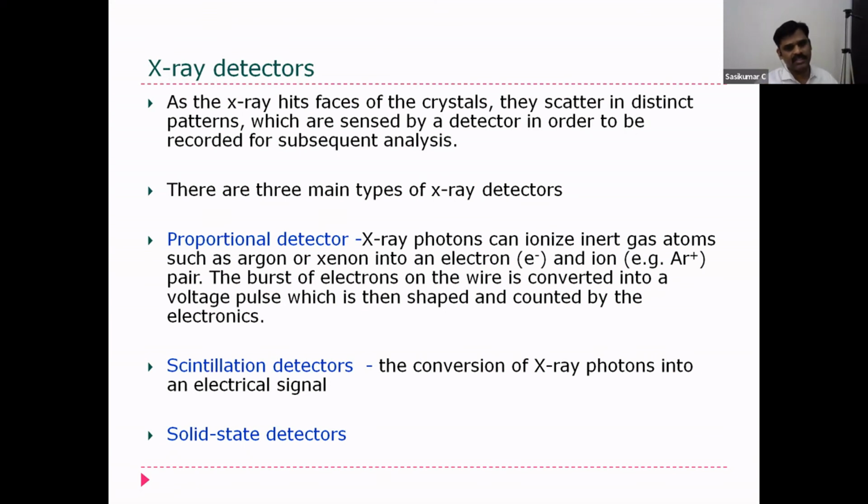So X-ray which is emitted or diffracted from your specimen is incident on this silicon chip, and the emitted X-ray is counted as a photon. So likewise, every signal will be counted point-wise, and it will count the total number of points counted from a single energy, and the diffraction pattern will be made for us.